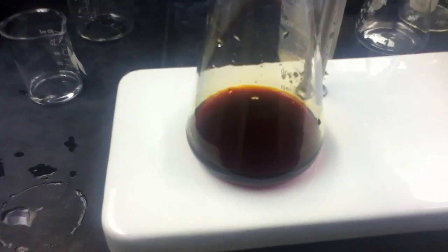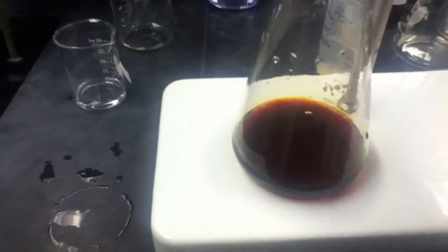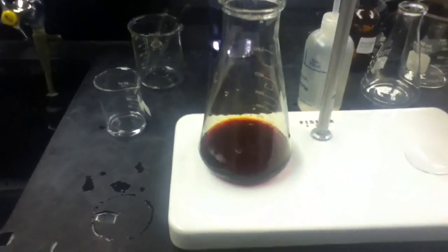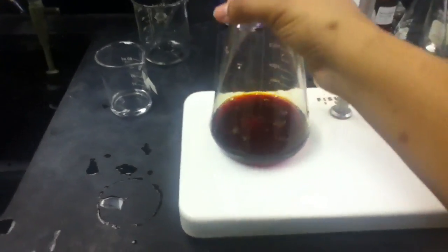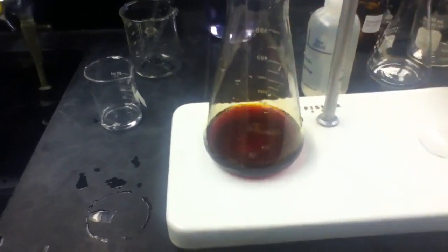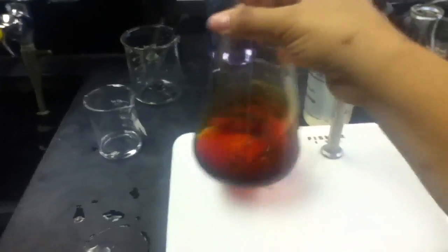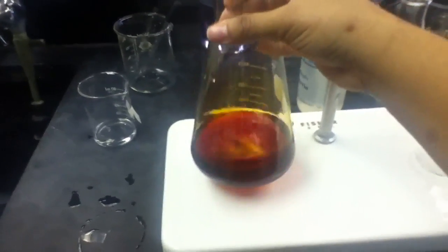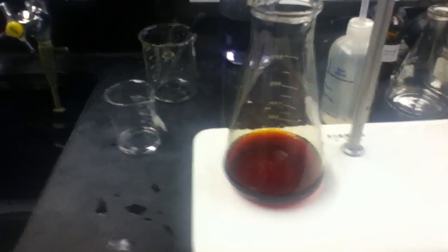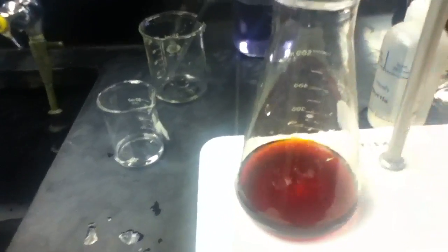We're going to titrate. While I'm thinking about it, I should slow that down so I don't accidentally miss it. I need to get myself 75 mL of water, and I also need to get 5 mL of starch.